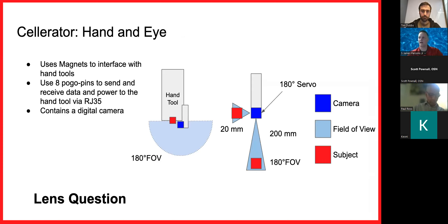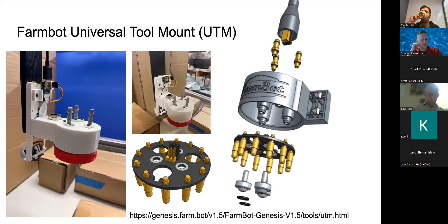All technicians have a hand and an eye, and I think that's paramount for what my machine does. My device has a hand that can interact with hand tools and uses pogo pins to send data between them. It also has an 8-megapixel camera attached to the hand so it can see what it's doing.